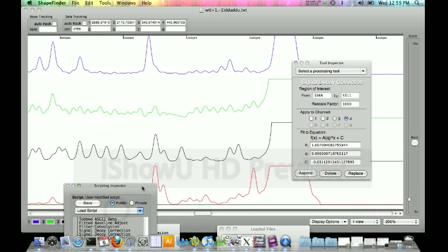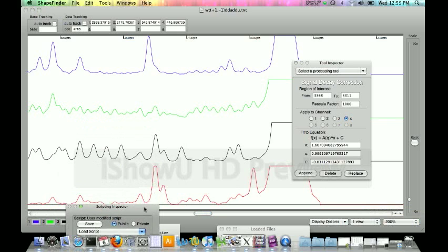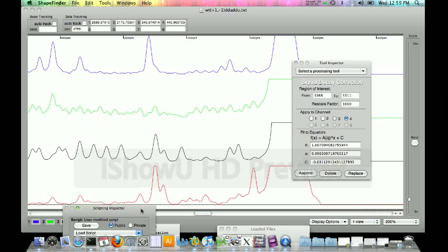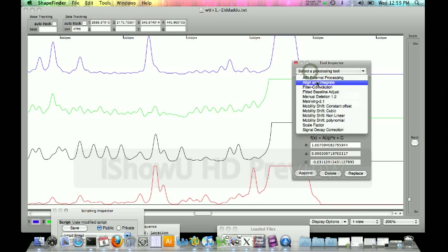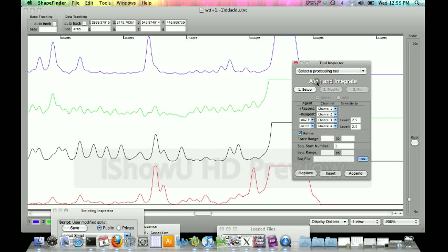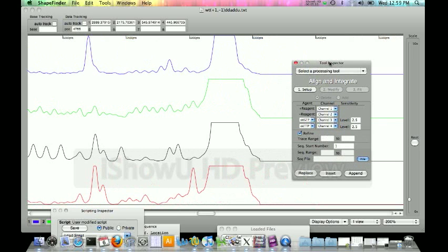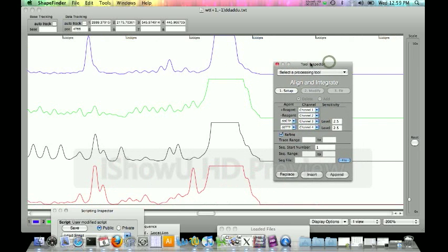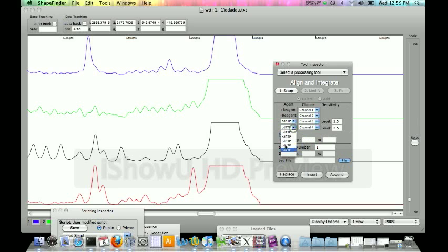Now the next tool we're going to use is align and integrate. This is where you tell the computer where the actual shape data is that you would like to analyze. You have to go through this step each time you do align and integrate. It knows the first channel is the plus reagent, the second channel is the minus reagent. What it doesn't know is what your ladders are that you are using. The ladders we're using for the third filter is a DDA ladder and our fourth filter is a DDU ladder.